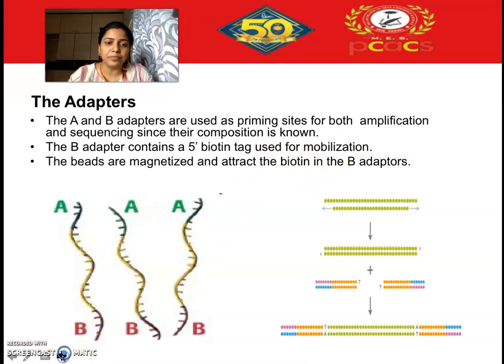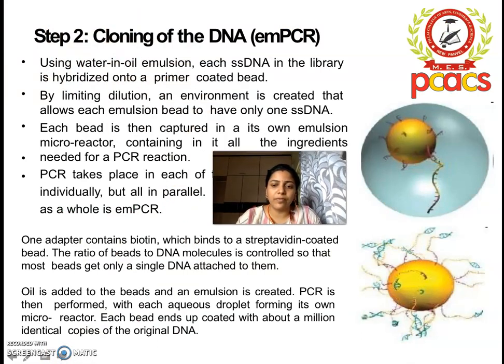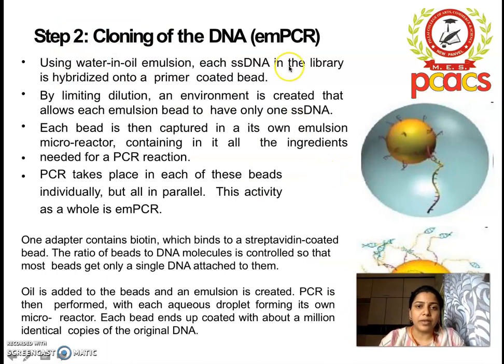Okay, so that is the role of your adapters. So next step, that is when the cloning is starting.